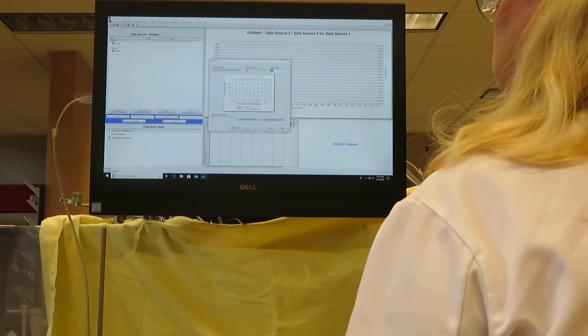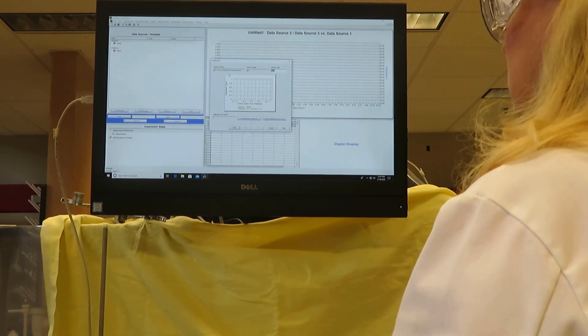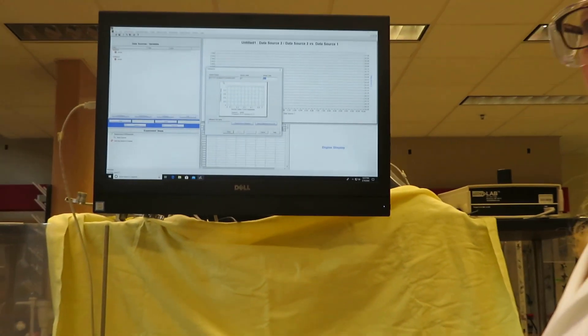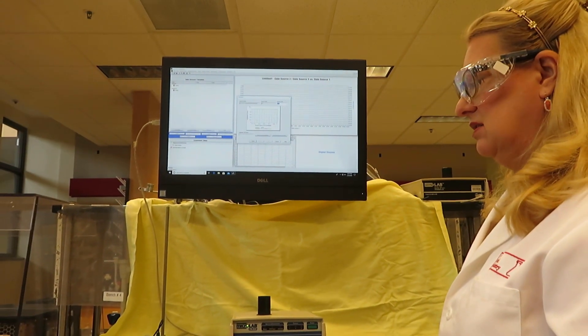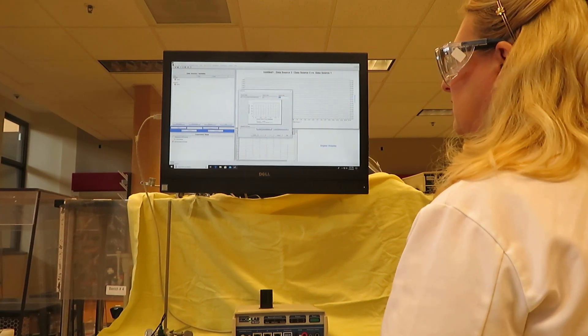Now we hit Next. The pH probe measures in millivolts, but we have to retrain it each time to determine what pH is associated with each millivolt reading. So we're going to perform a new calibration.